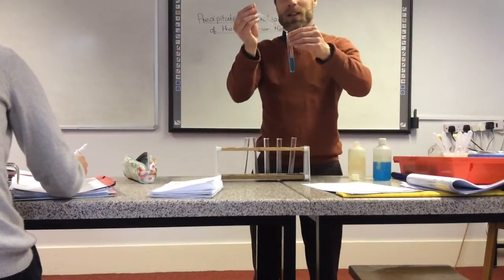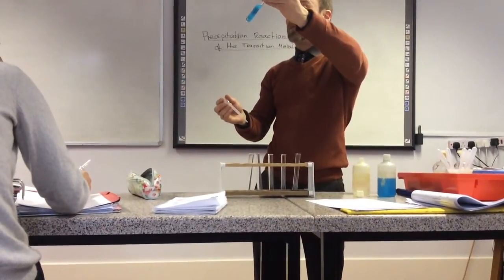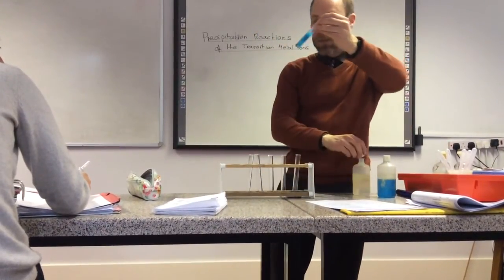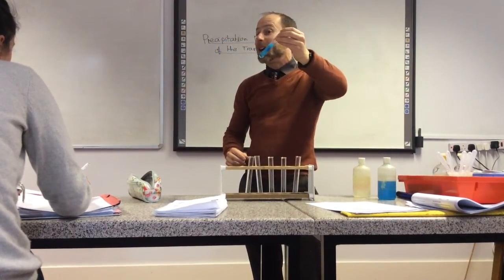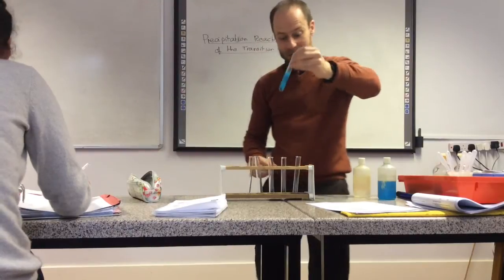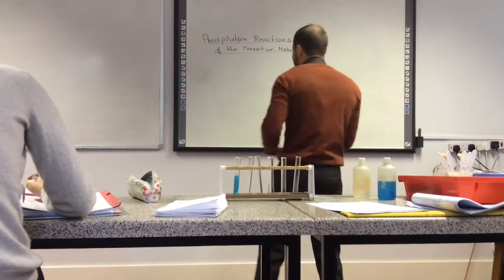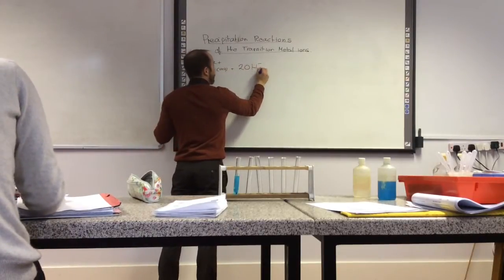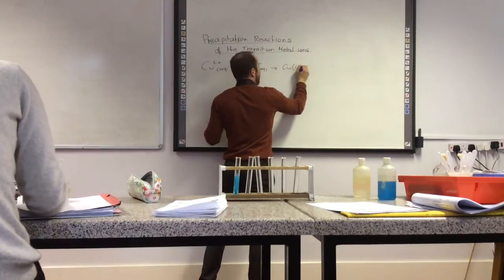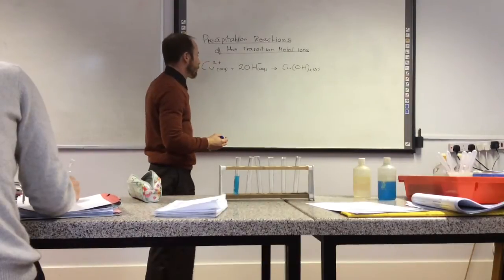Sodium hydroxide — is it going to work? Nice. We're happy that that is a blue precipitate. We gave a special name to that type of precipitate — we said it was a jelly-like, gelatinous precipitate. So that is a light blue precipitate. We took copper 2+ ions, added hydroxide ions, and got a light blue precipitate of copper 2-hydroxide.